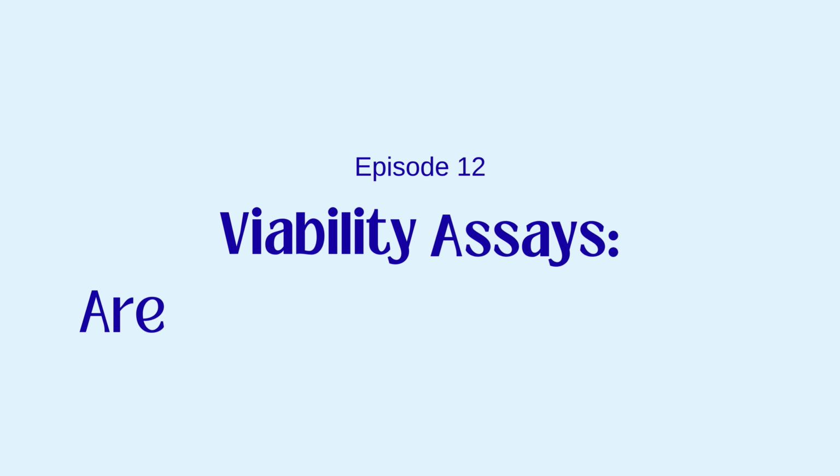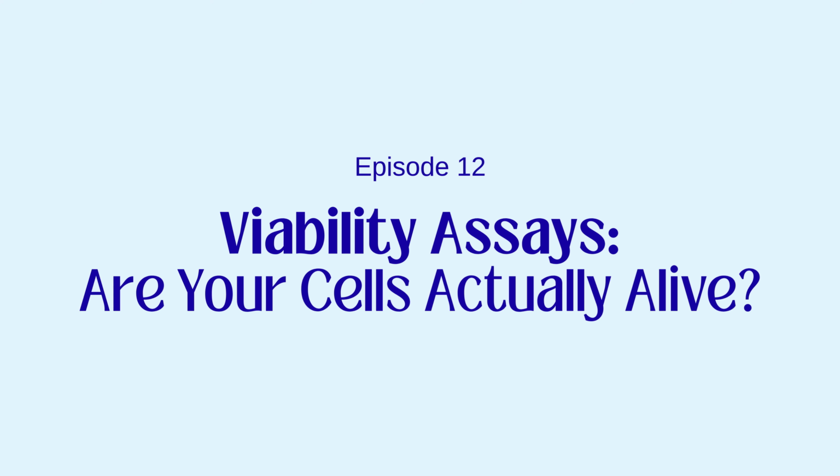Let's get into episode 12 of our cell culture series. Viability assays. Are your cells actually alive? In this episode, we'll learn how scientists measure cell health, distinguish live cells from dead ones, and ensure experimental results are reliable before moving forward.